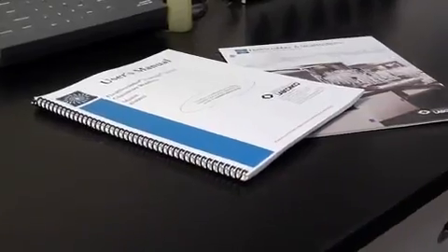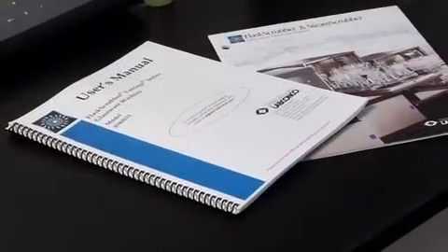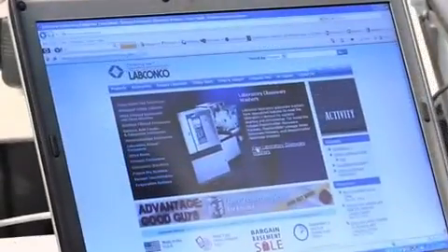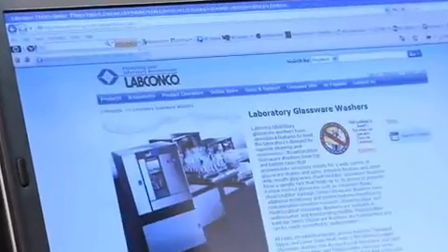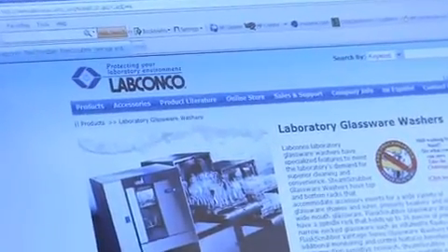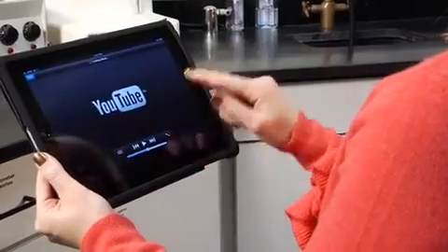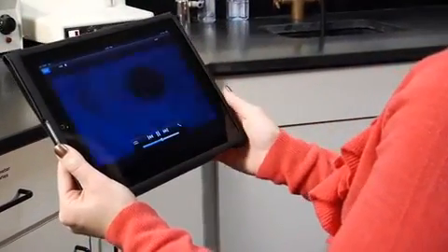Complete information on testing, maintenance, and troubleshooting for your washer can be found in the user's manual. A brief video on programming your LabConco washer is available on LabConco's website at labconco.com and on YouTube at youtube.com/labconcocorporation.